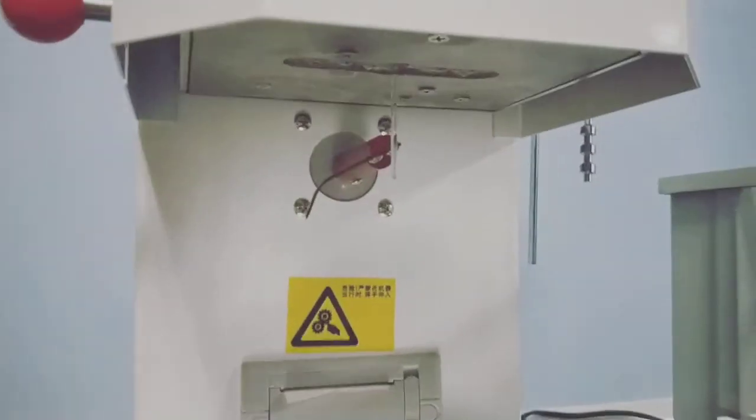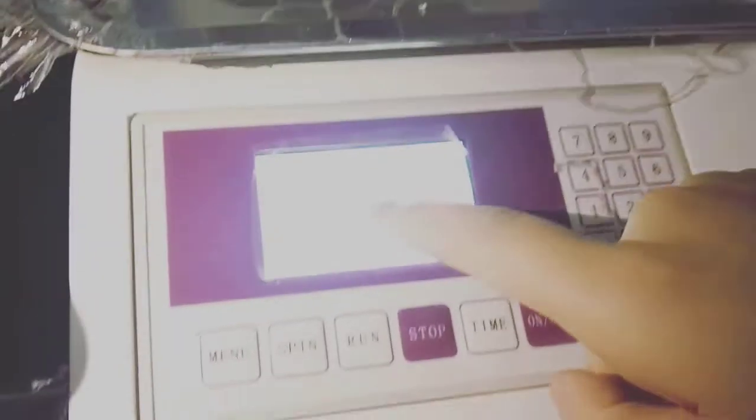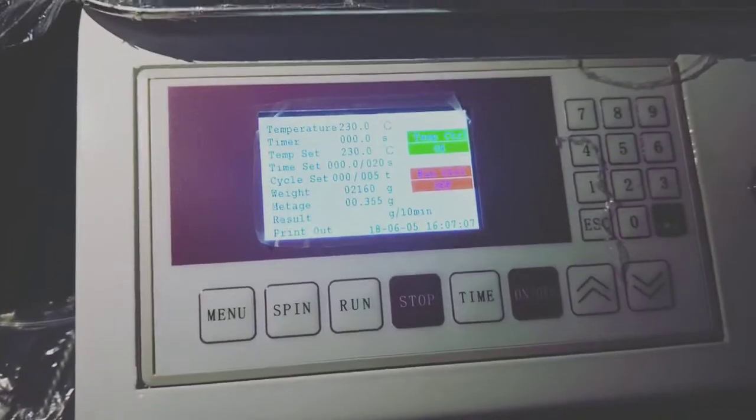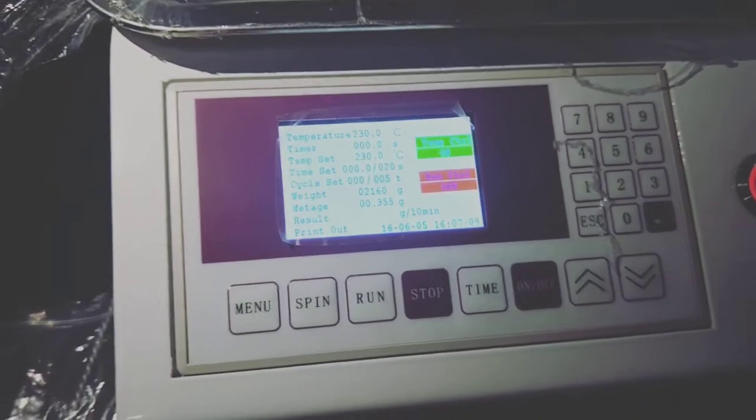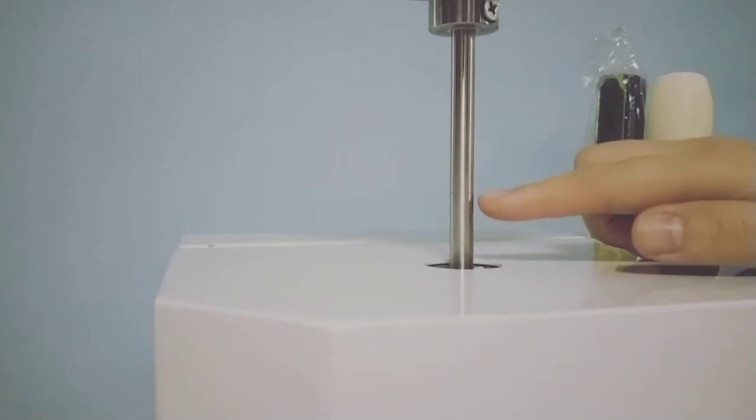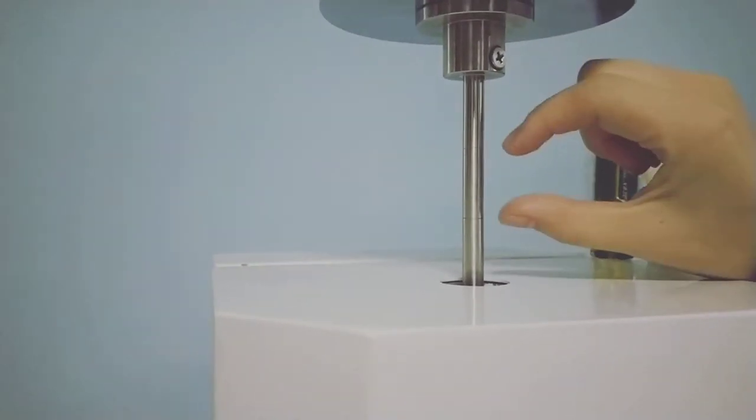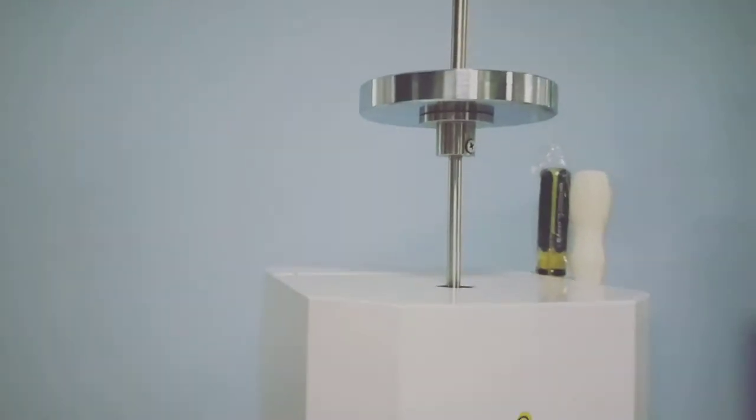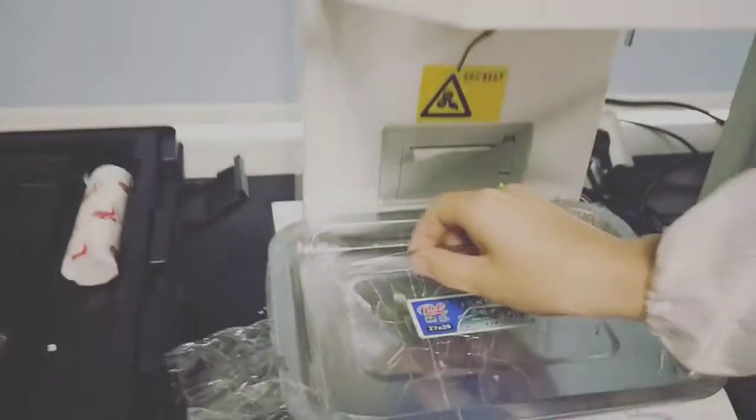As we can see, the extrusion speed is slow. Then we can change the cut time to 20 seconds every piece. It means automatically cut one piece every 20 seconds. We need to wait for the weight rod to move to this curve and then automatically cut it. Now we can use manual cut. And this sample we do not use.